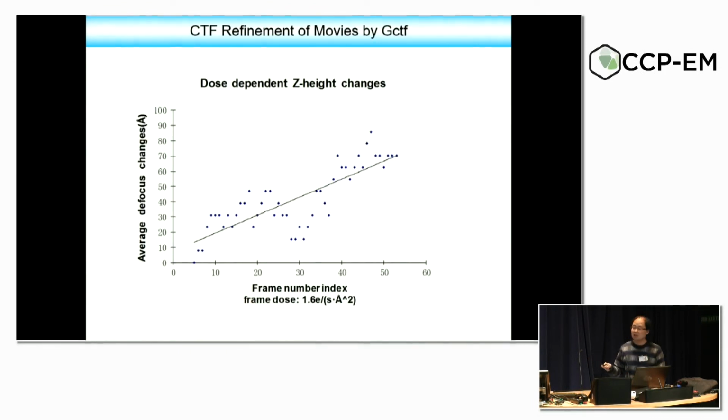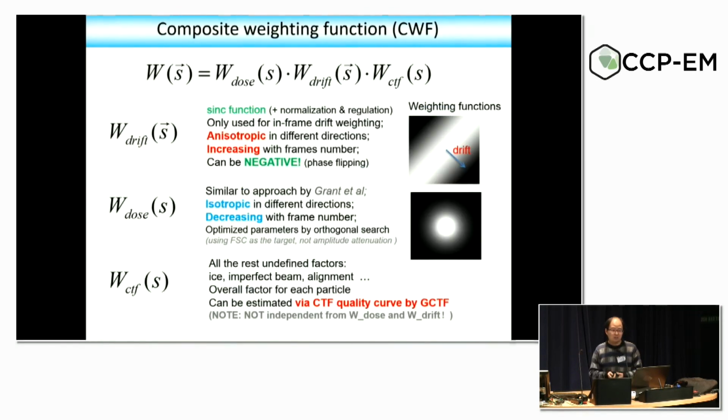It's quite noisy, but you can see the trend is pretty good. Then maybe you can also do a similar approach like the smoothing, similar to the phase shift estimation, to constrain the defocus changes along the z-axis. After you estimate the single-frame CTF, you can do better weighting, etc. But that's something we can discuss later.